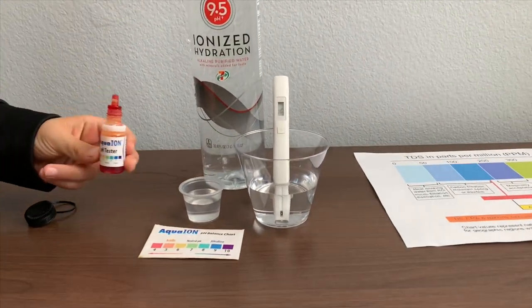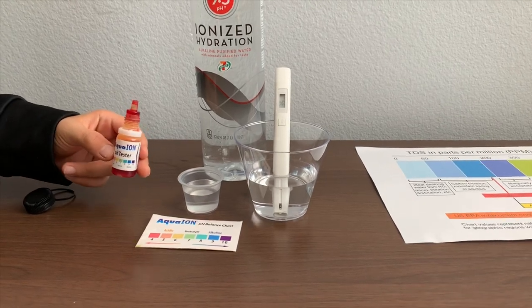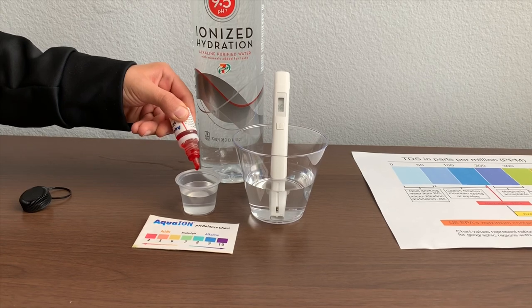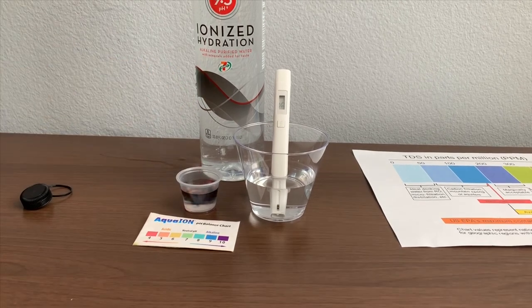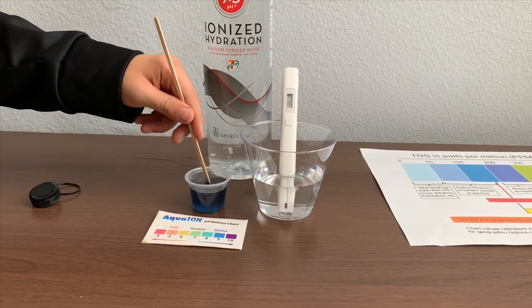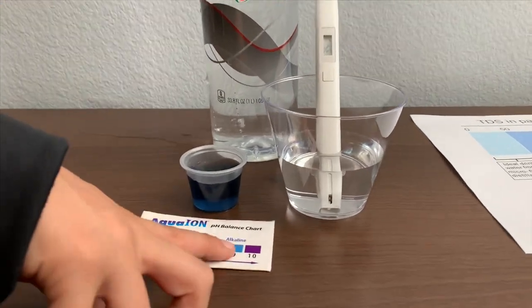Now let's test the pH level. If you want to buy this pH tester, check the link down below. Only two drops. Let's stir it a little for a better result. I give this a 9.5.